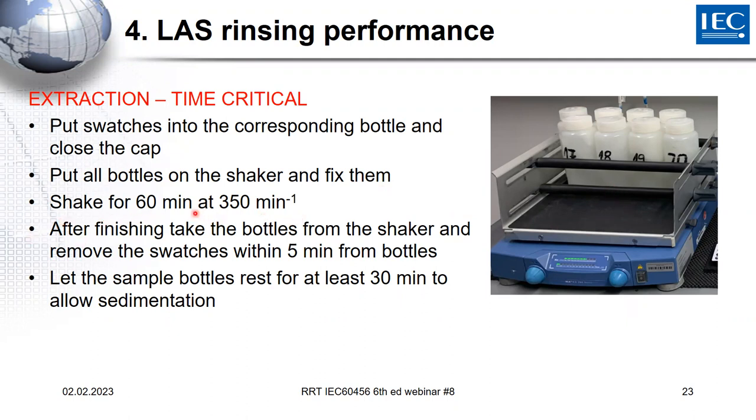After shaking for 60 minutes, you remove the bottles from the shaker, you open the bottles, and you take out the swatches, usually by using tweezers. This should also be done in 5 minutes. After this, you have some more time, because you should let the sample bottles rest for at least 30 minutes to allow the sedimentation of fibers and whatever is still in there. You can put the cap on it, but you should not screw it tight.